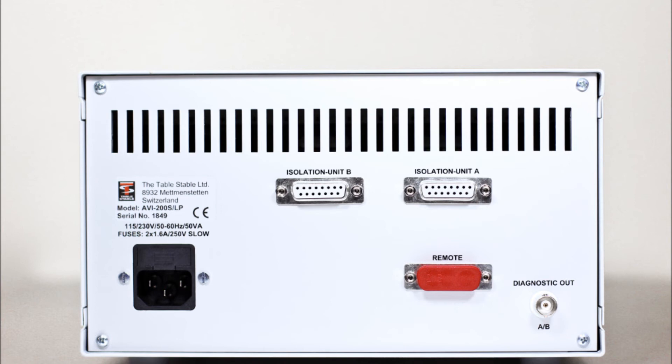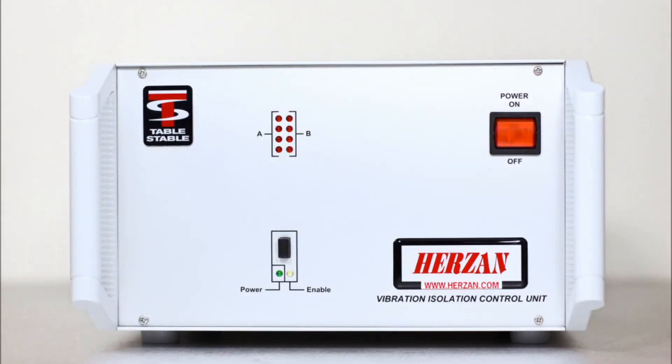Once the D-sub cables are connecting the AVI modules and controller, connect the power cable found on the back of the AVI controller to a power outlet within the room. Power on the AVI controller by pressing the front red power button.